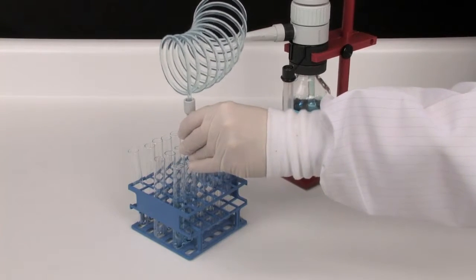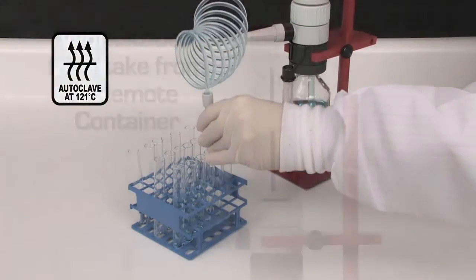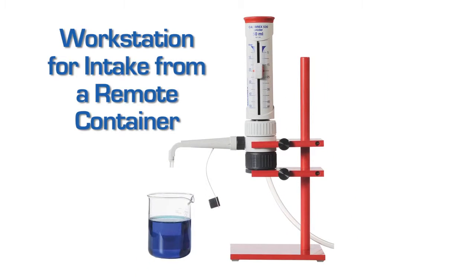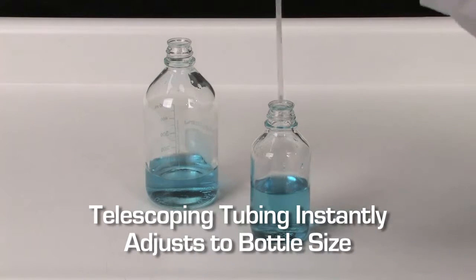No tools are needed for assembly or removal for cleaning or, if required, autoclaving. The workstation facilitates liquid intake from a drum or other remote container. An optional telescopic tubing instantly adjusts to bottle size.